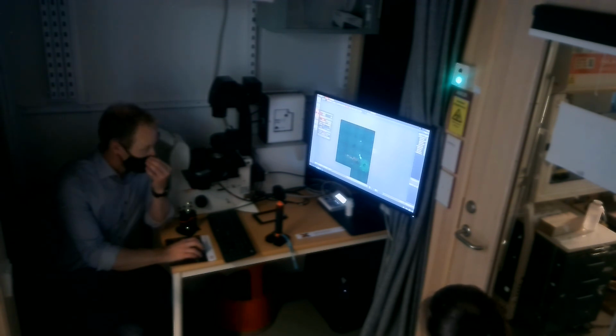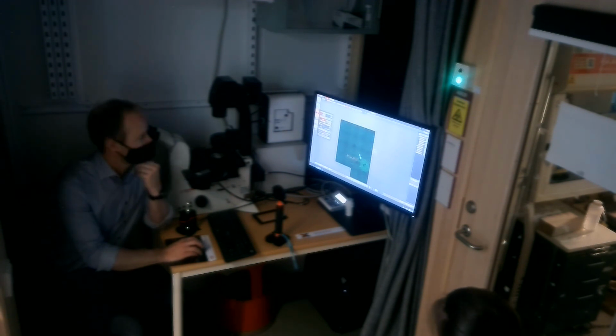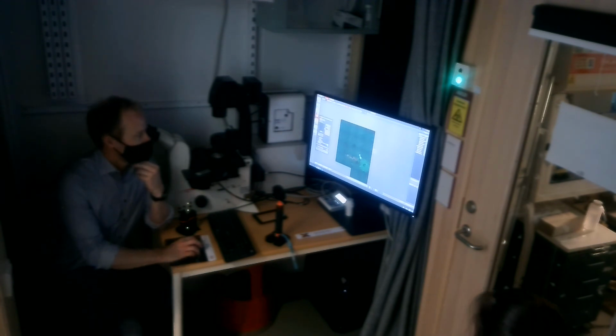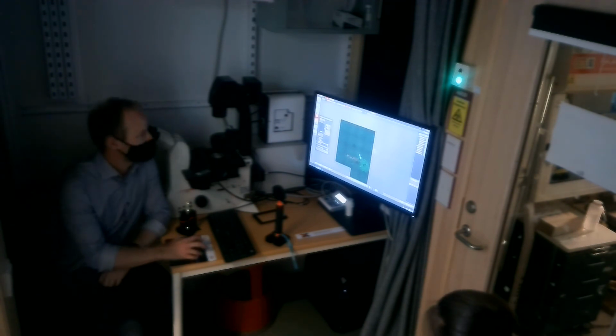All these experiments with mount position and tile scans and so on, you can of course combine with the Z or time. Clicking on Z, I activate it, and again I'm getting the tool only when I need it, and here it is. It looks very similar. It's almost identical to what we saw before. It's slightly different, but more or less identical. So again, you have the beginning and end. You would set it up the same way.